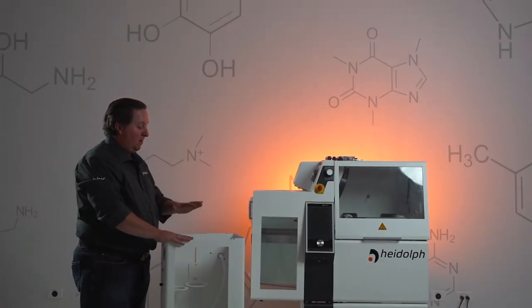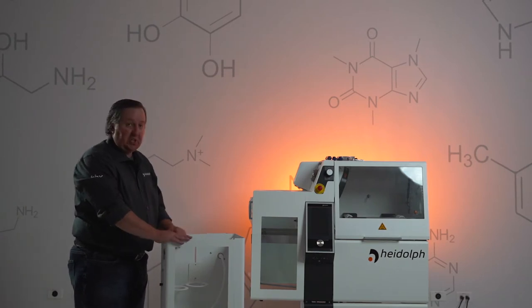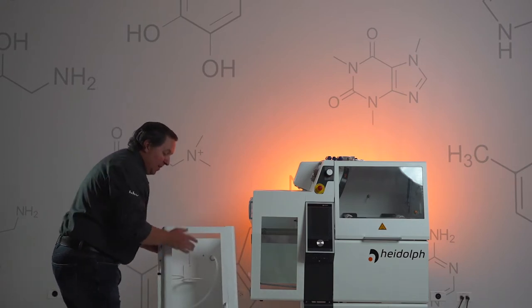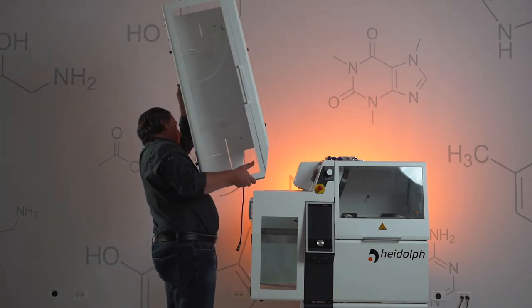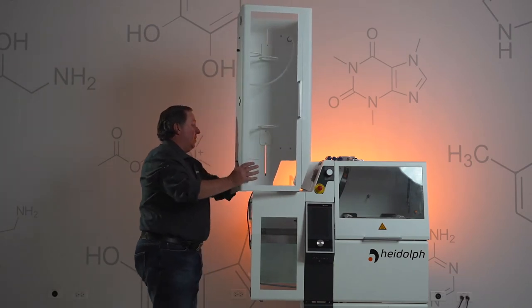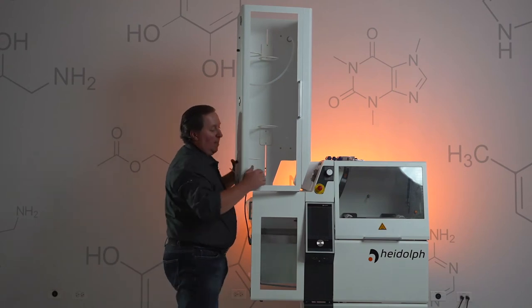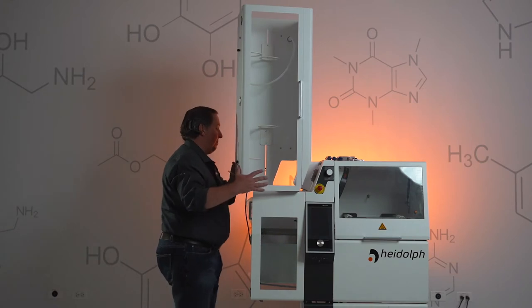Our next step is going to be lifting up the cabinet and placing it on the mantle. One person can do it, but if you feel more comfortable, I advise getting somebody else to give you a hand. It's not super heavy, it's just kind of awkward. Grab it by the base, get it placed in position. You're going to want to make sure that your vacuum line and your vacuum sensor both come out the back and you're not pinching them. Then slide it into position to align our screw holes in the cabinet with the screw holes on the mantle.